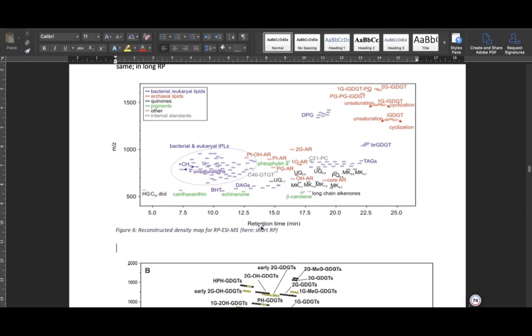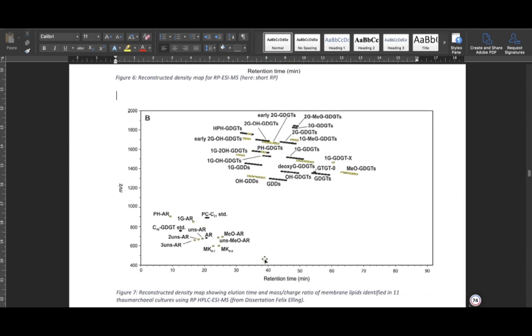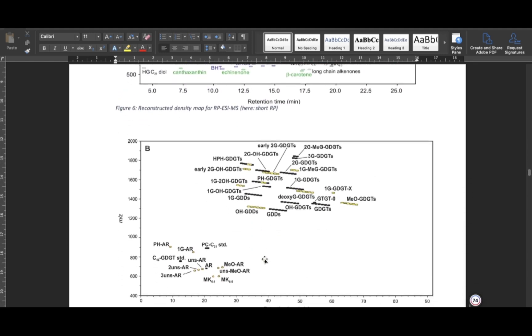Here we have samples analyzed in the short RP method and samples analyzed in the long RP method. When you want to work on a sample analyzed in the short RP method, these compounds are present at this retention time and at this mass. The same thing applies for the long RP samples.